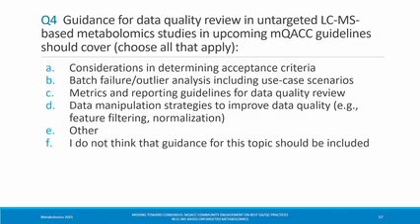And I think that's worthwhile thinking about because when we're throwing a reference material at a system, looking at it from a data analysis perspective is one aspect, but trying to capture the issue earlier in the process at the data acquisition point, using diagnostic compounds and quick tests, quick reporting, I think is something that could be thought about. Absolutely.